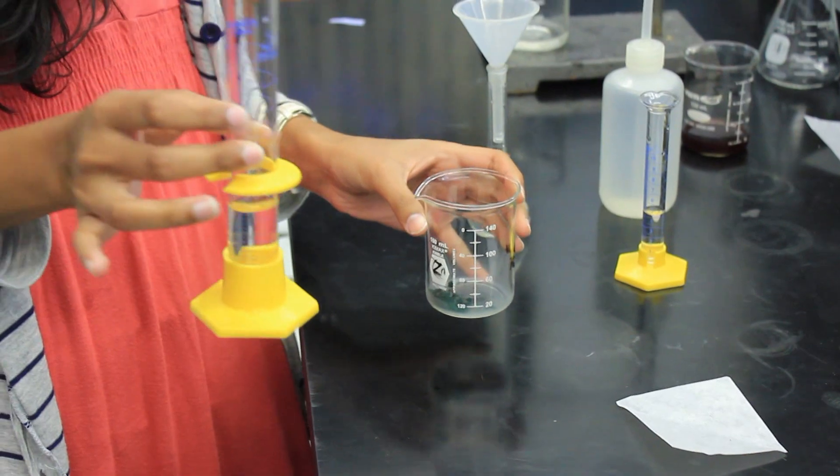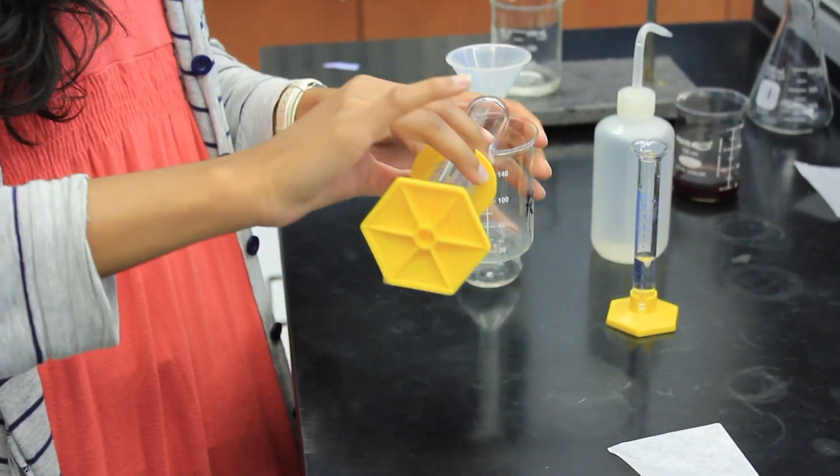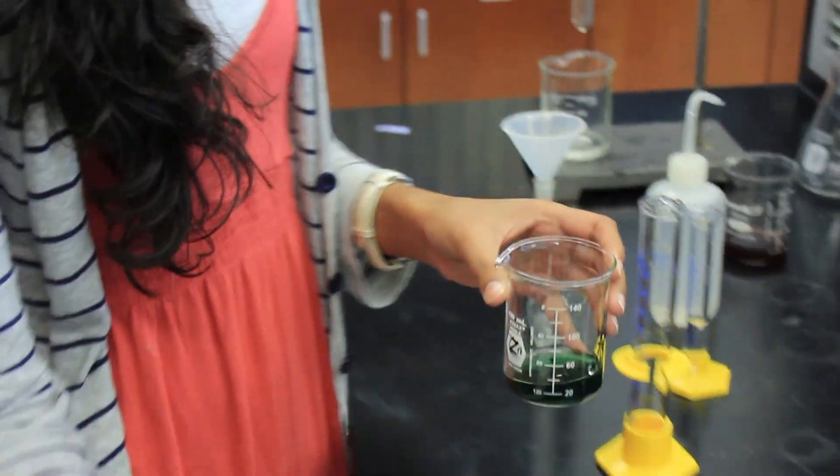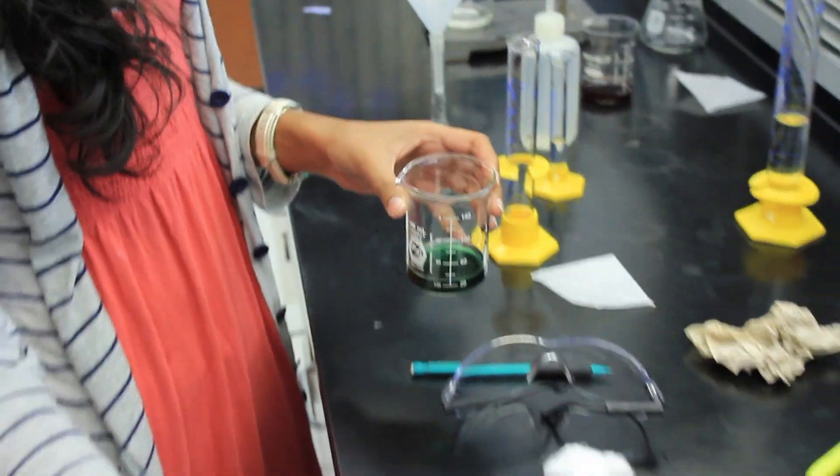Now we're going to add 20 milliliters of DI water to the green crystals. Then we're going to add 0.4 grams of zinc into the solution.